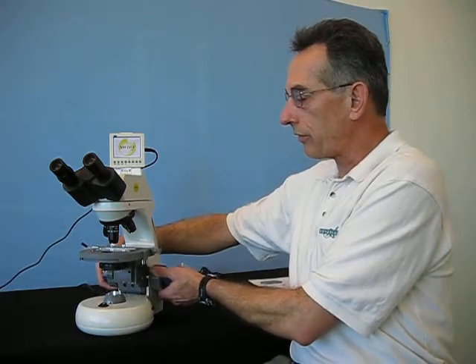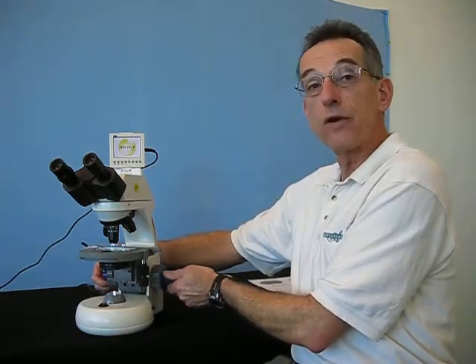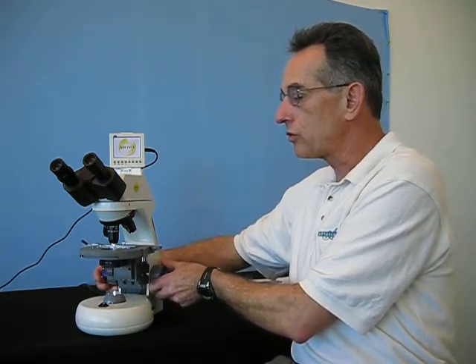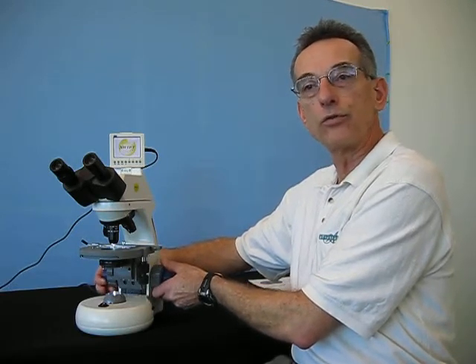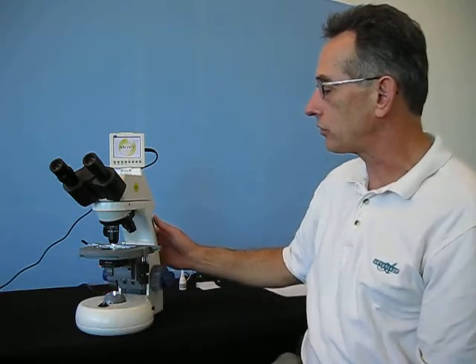On both sides of the microscope body, there is both a coarse and a fine focus mechanism. Get to a general position with the coarse focus, and then fine-tune your focus with the outer knob and bring everything into sharp resolution.